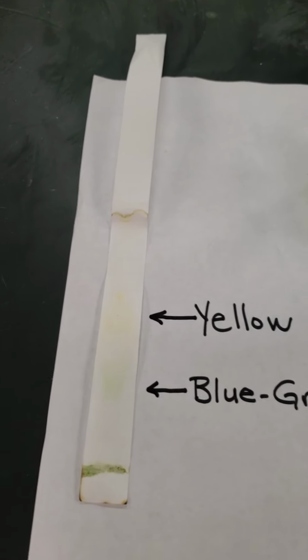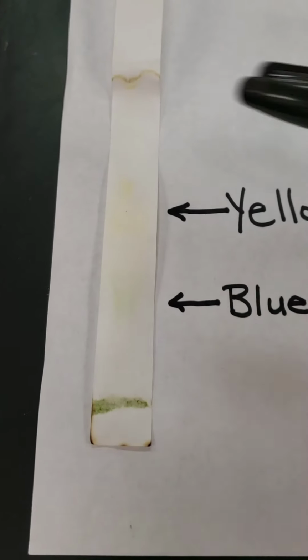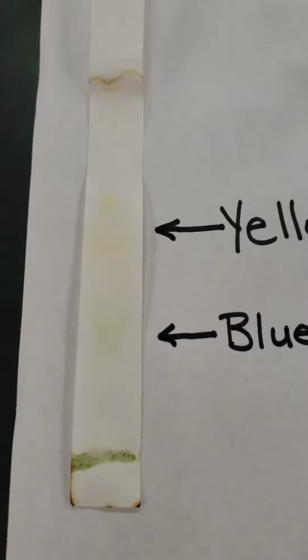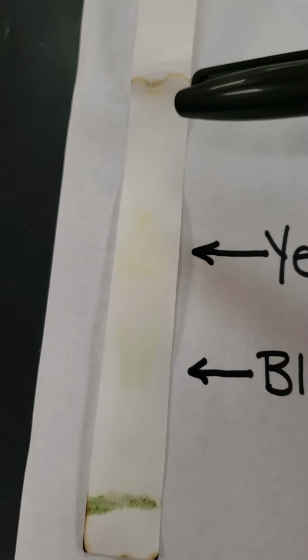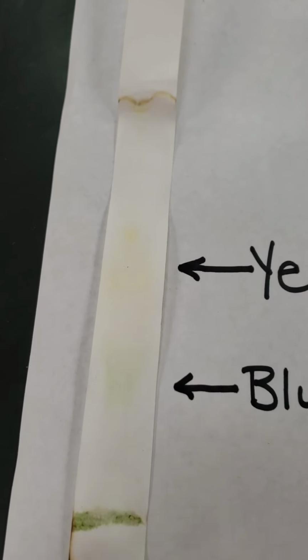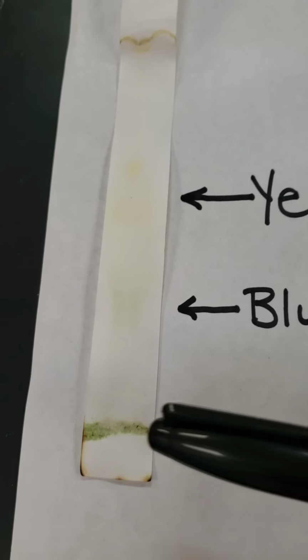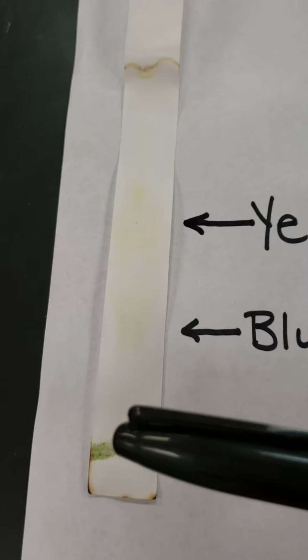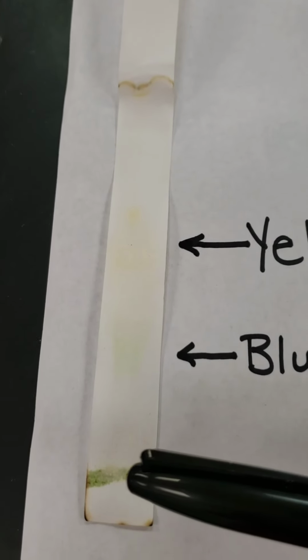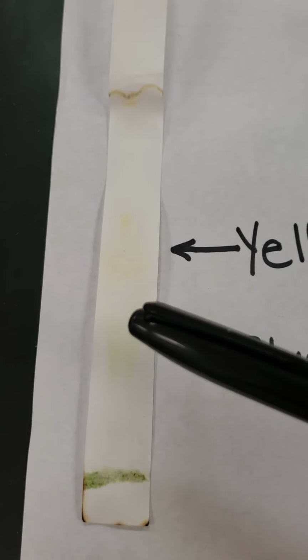Remember, I took the piece of spinach and I rubbed it here on this filter paper, and then I dipped this whole piece of filter paper into rubbing alcohol, and the rubbing alcohol soaked up the filter paper, and as it passed through the chlorophyll right here, the pigments that make up the chlorophyll dissolved in the alcohol, and so they were taken by the alcohol up the filter paper.